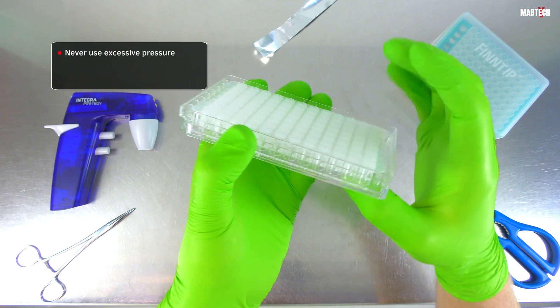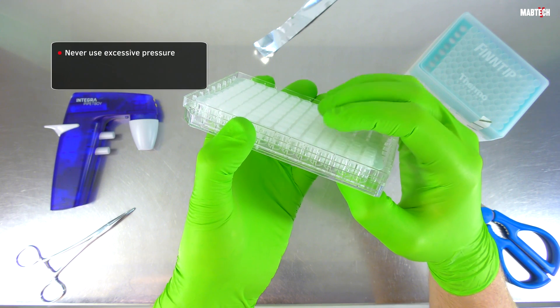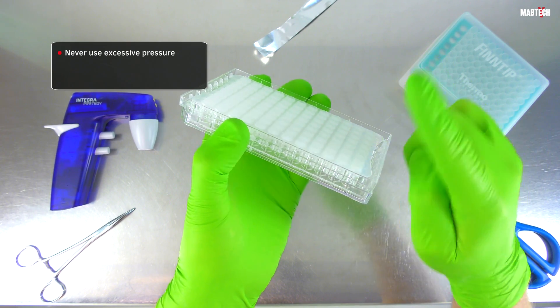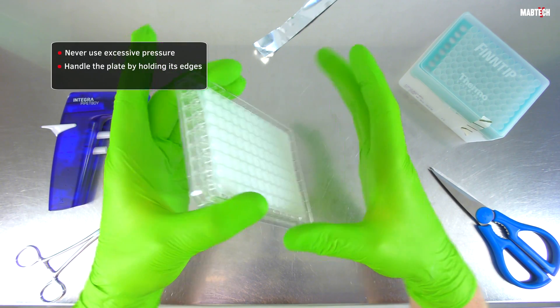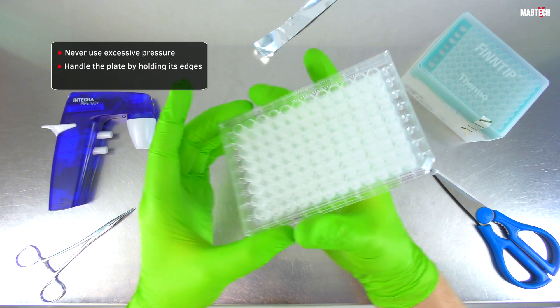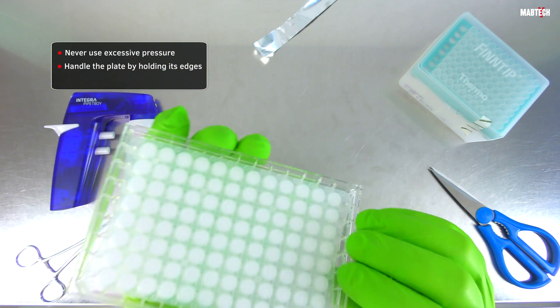First, never put excessive pressure on the backside of the underdrain with your hands. Throughout your experiment, handle the plate by holding its edges, not its underside. Do not use excessive force when gripping the plate.